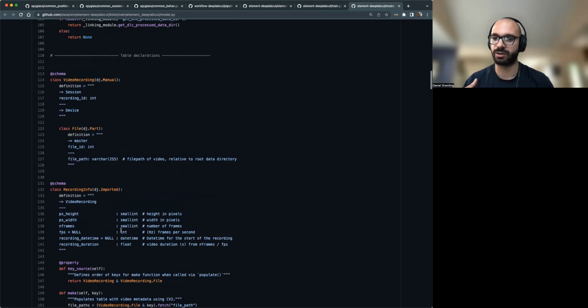It brings that all in, and then it makes some modifications to better handle paths. Of all the config files for DeepLabCut I've seen, it's absolute path information. Well, if we're DataJoint and we're making the promise that this upstream method of get root directory is going to work for you, then I need to modify that path information in the config file that we're managing. Okay.